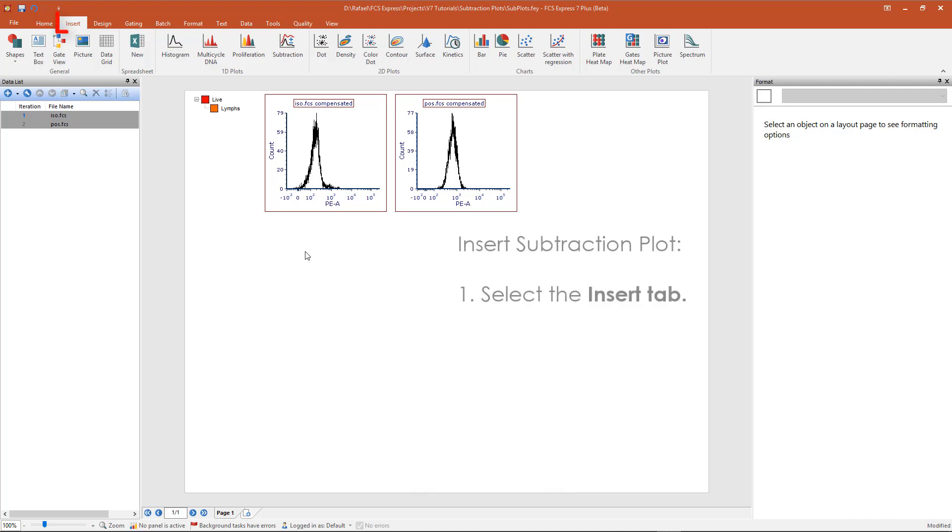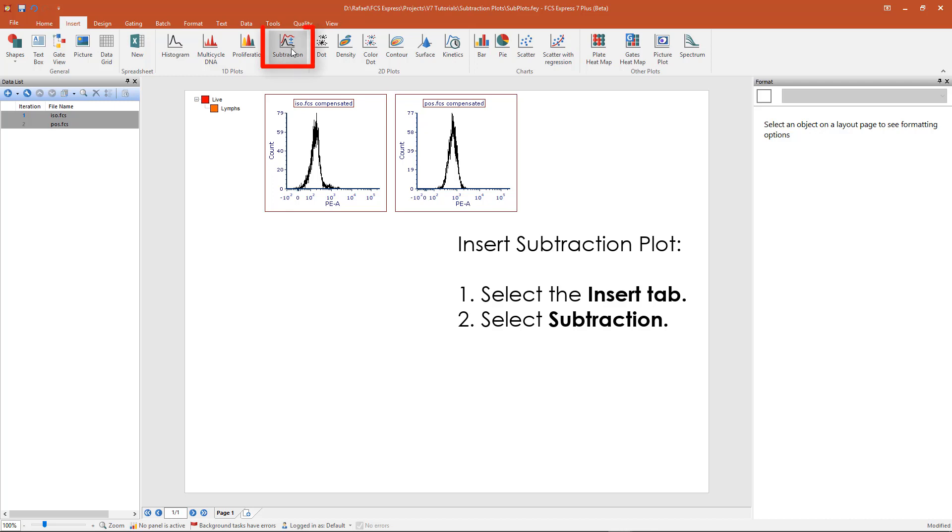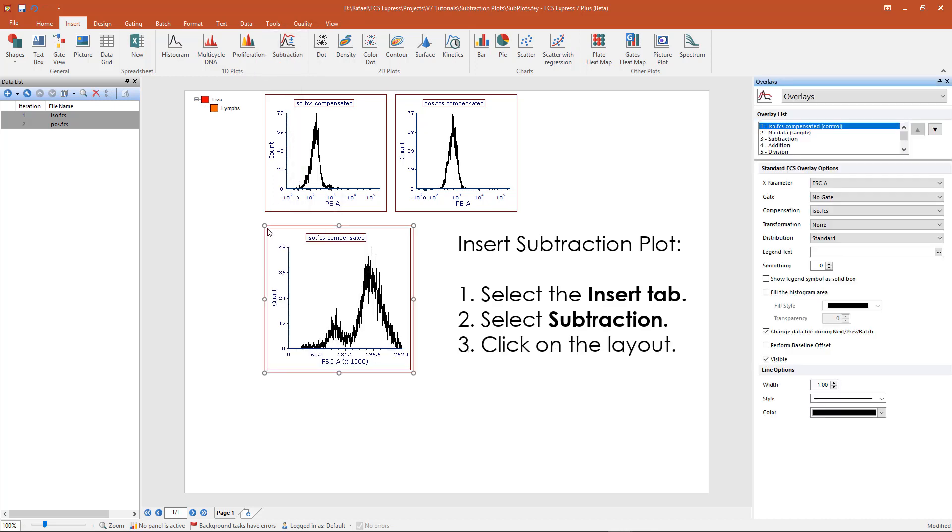To insert a subtraction plot, select the Insert tab. Then, in the 1D Plot section, select Subtraction. Click on the layout once to insert the plot.